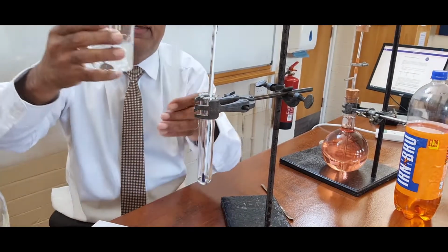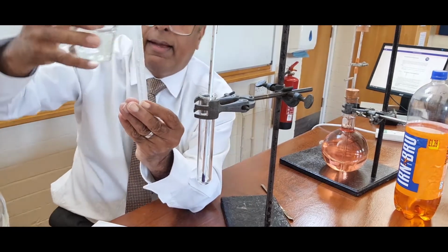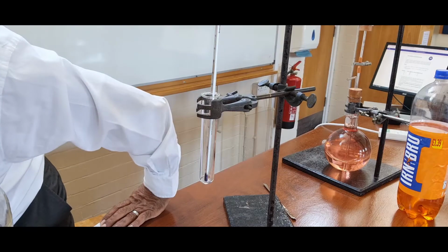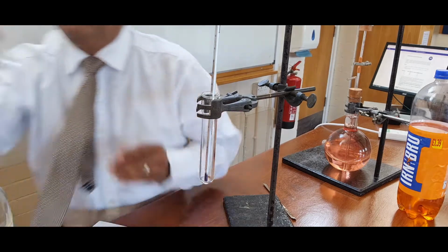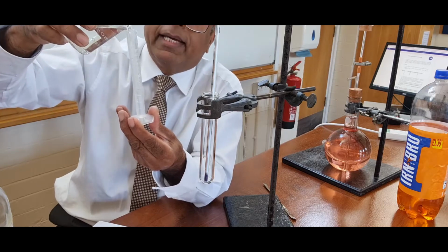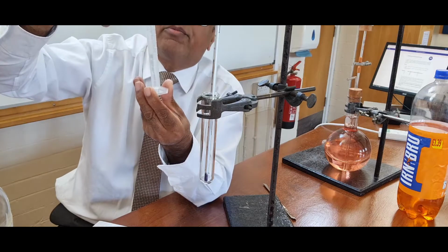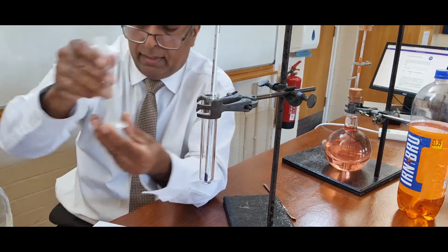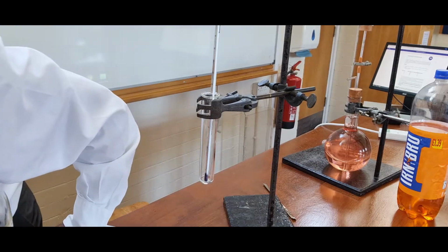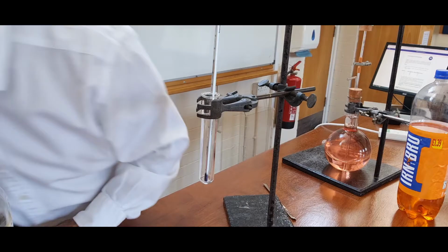So carefully, if I put distilled water in there, I've got far too much. I need to pour out some, and I've poured out far too much. I need to put some more back in. A few more drops. I'm about half a centimetre over, so just take that out.